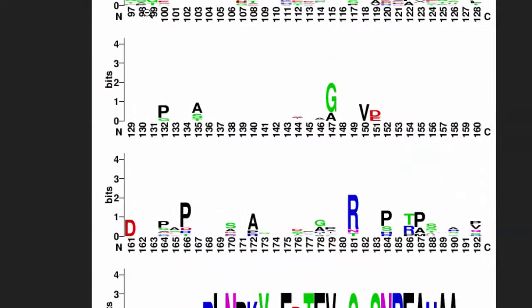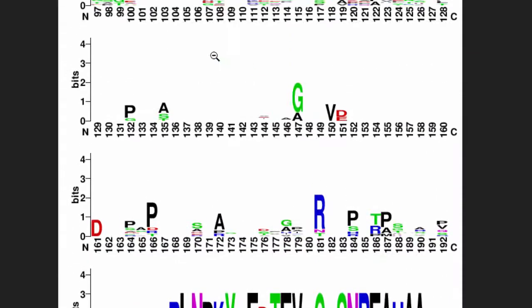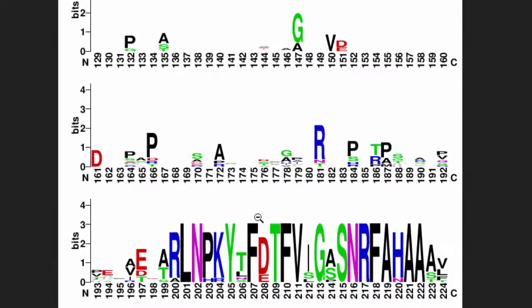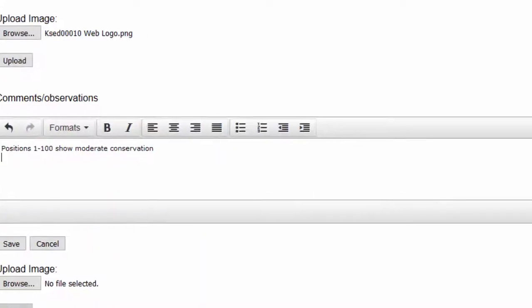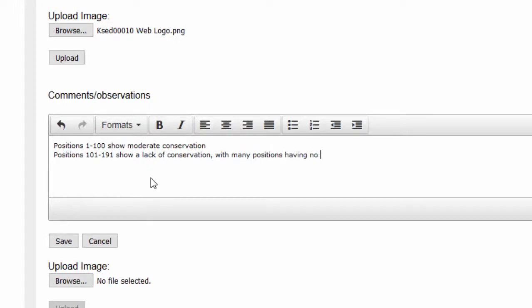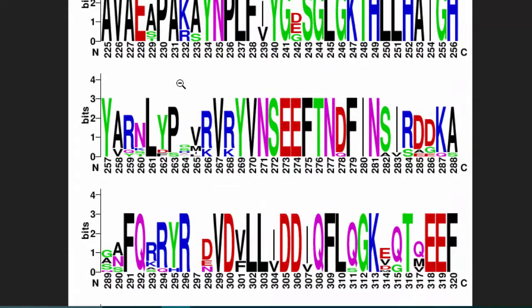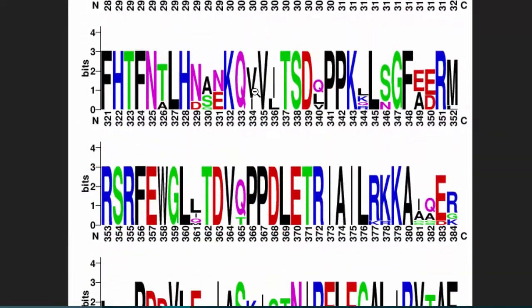Then I would look for another pattern. So from—I could even go to 100—starting at position 101, I have this dead zone. So really, it's 101 until really 191. 101 to 191 show a lack of conservation with many positions having no letters at all, which means again no conservation.